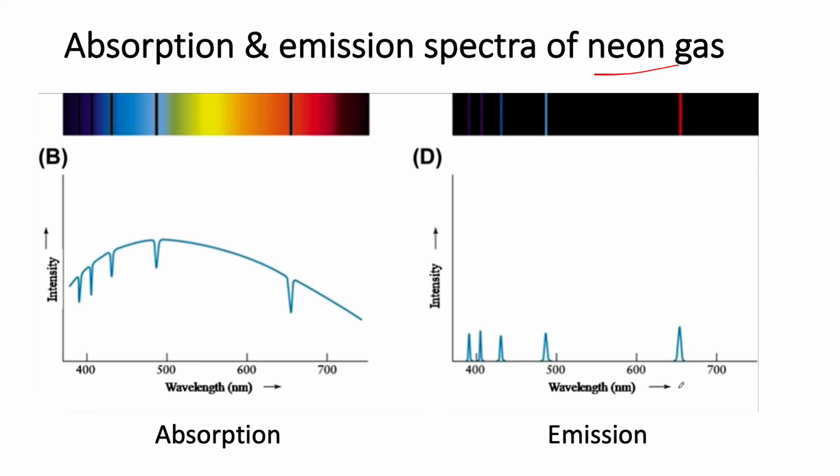Okay, so this is an emission spectrum and an absorption spectrum. The absorption spectrum would also be called a transmission spectrum, right? Because you're looking at the transmission, although it hasn't been normalized. You get less transmission when you're looking at the absorption spectrum. It's also the transmission spectrum. You're looking at a decrease in transmission, which is the same as the absorption. Whereas this is coming from an emission spectrum.